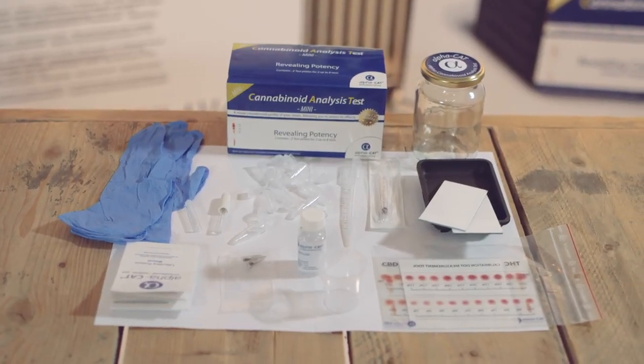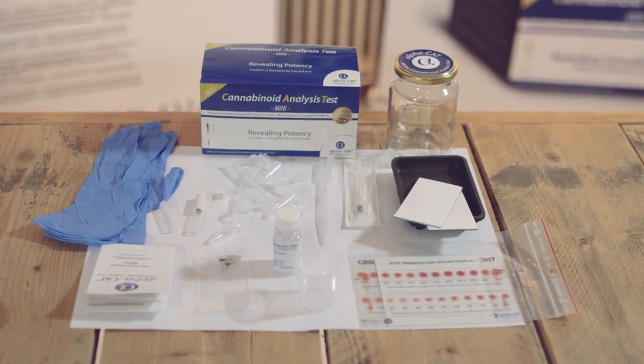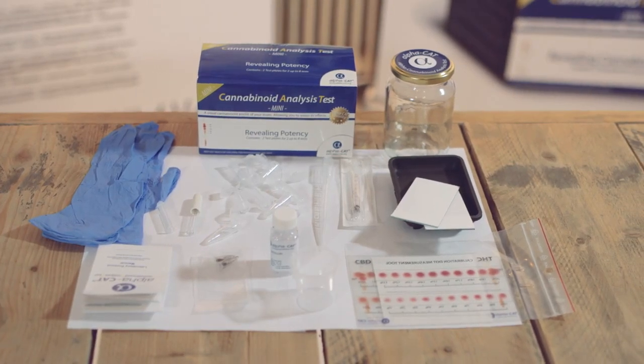The kit is mobile, so you can take it anywhere and test all kinds of products to accurately dose and label your cannabis-derived products.